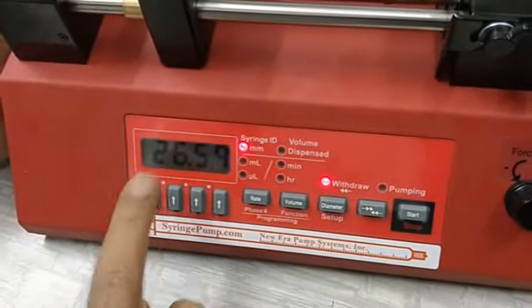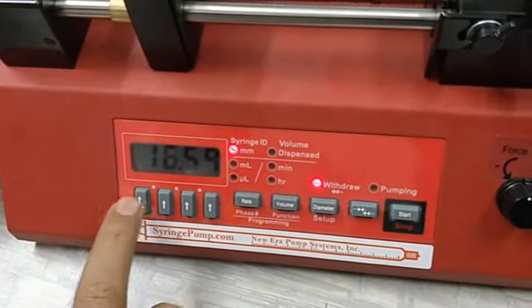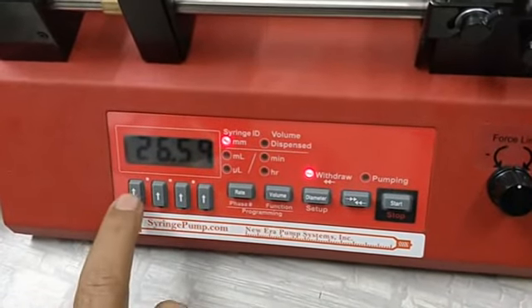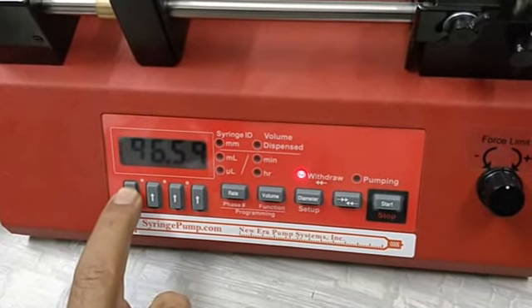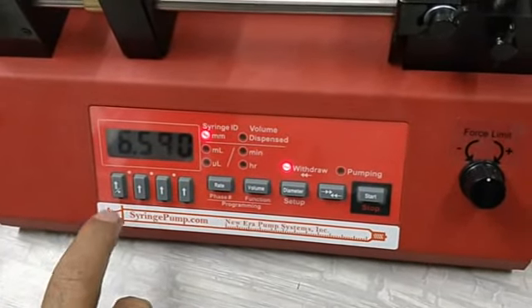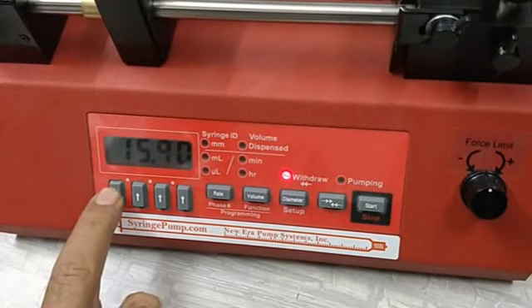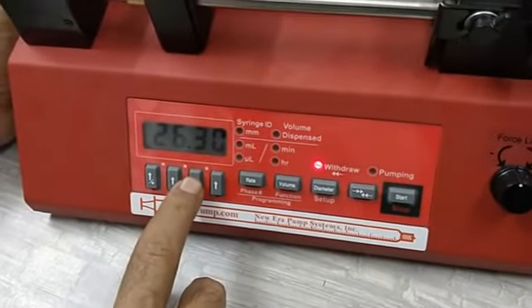Each arrow key corresponds to one digit. By pressing the arrow you can cycle through digits 0 to 9. You can also keep a key pressed continuously and the cursor arrow will move to the desired position — release the key at the position you want. So I am setting the diameter to 26.59.